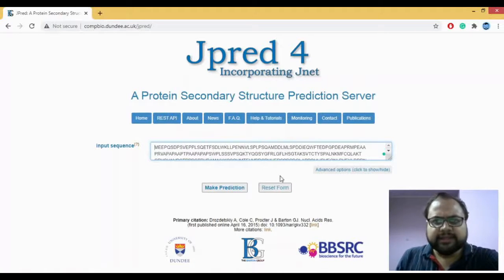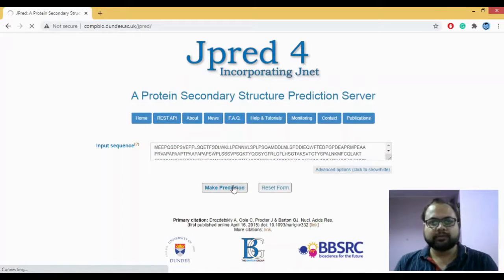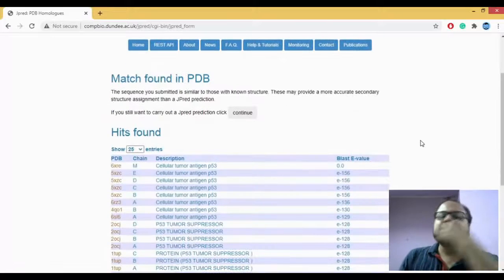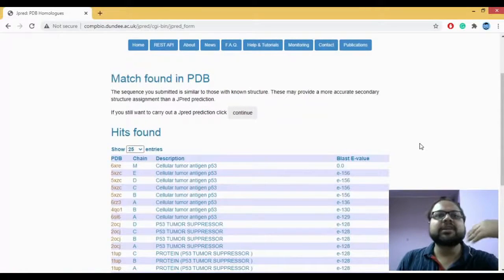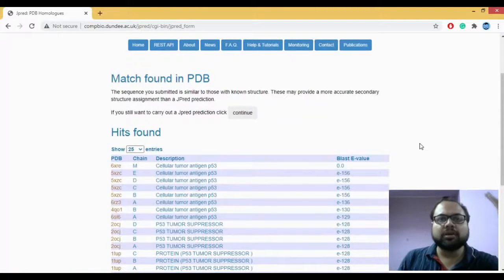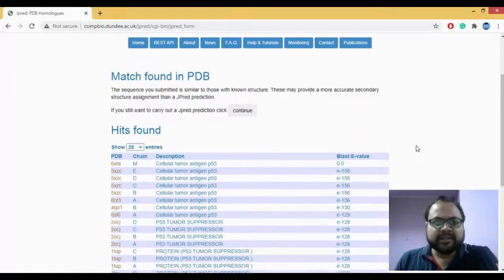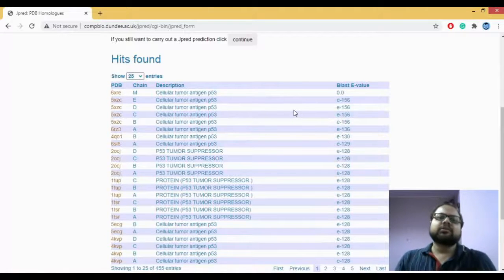I'll click on 'Make Prediction'. What this does is it takes the query sequence and carries out BLAST. When BLAST is done, it has given us 25 entries — these are the protein structures which are already present and available for p53, along with a BLAST e-value score.